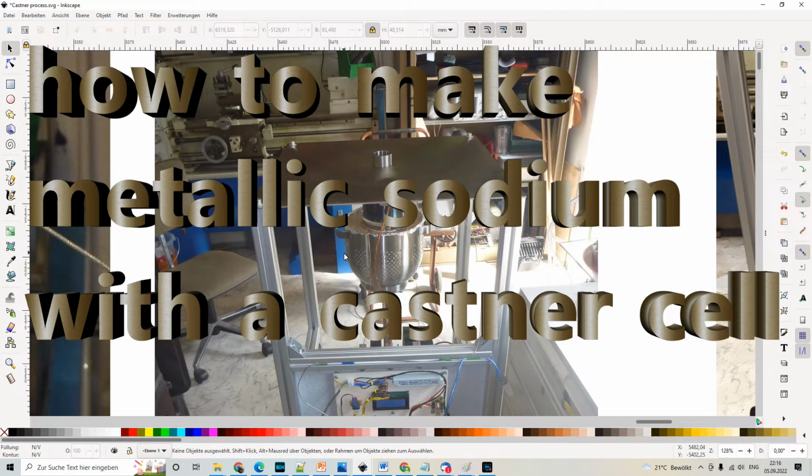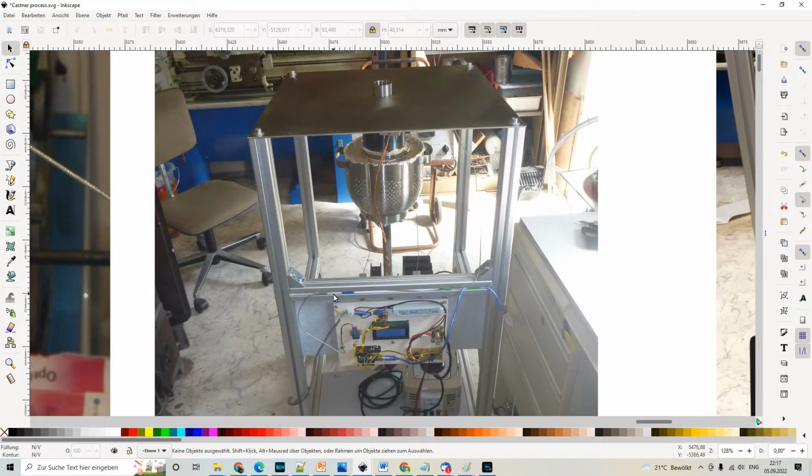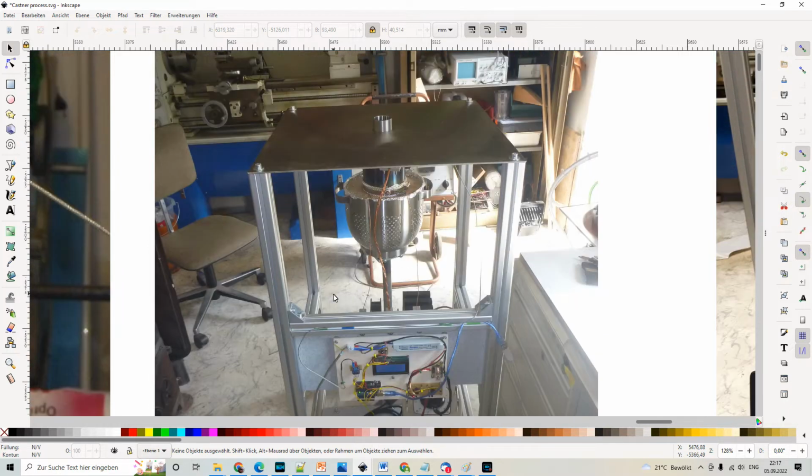Hello everyone. Today I want to talk about a project that I did many years ago, I think 10 years ago, and it's about making elemental sodium by electrolysis. This project was pretty cool, but also pretty dangerous, and I invested a lot of time into it to make it work. So I want to share all the research results with you.